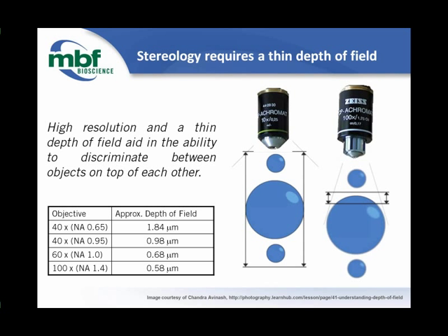When you are performing stereology with bright field or wide field structured illumination applications, these thin depths of field are provided mainly by the objective lens, the numerical aperture of the objective lens. For bright field applications, it's also impacted by the condenser that's used. When you're looking for something that's very small, however, you want to have greater resolution than can be provided by the objective alone.